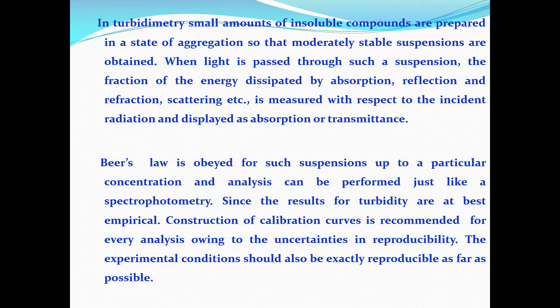What you have to do is to prepare the reagent and standards, mix them in suitable proportions under optimum pH conditions, temperature conditions, shaking conditions, etc.